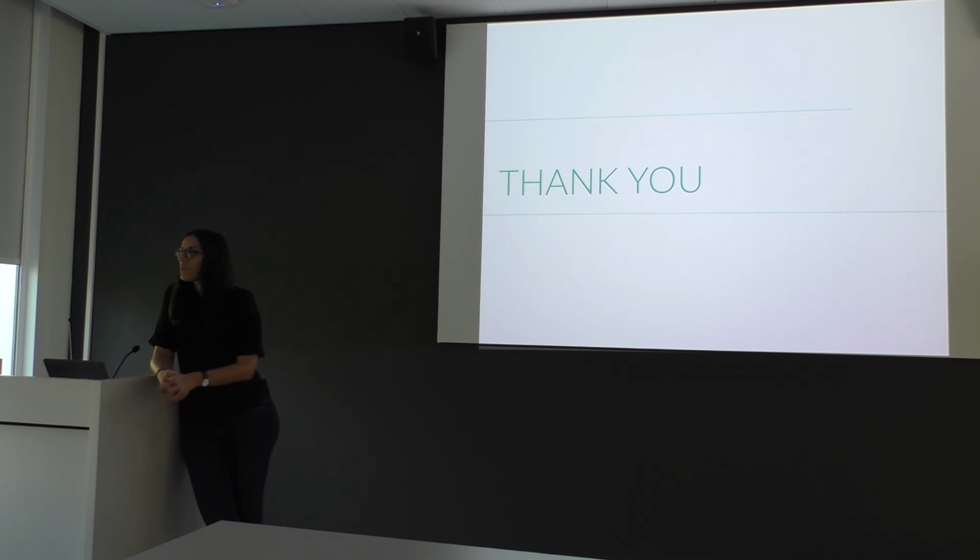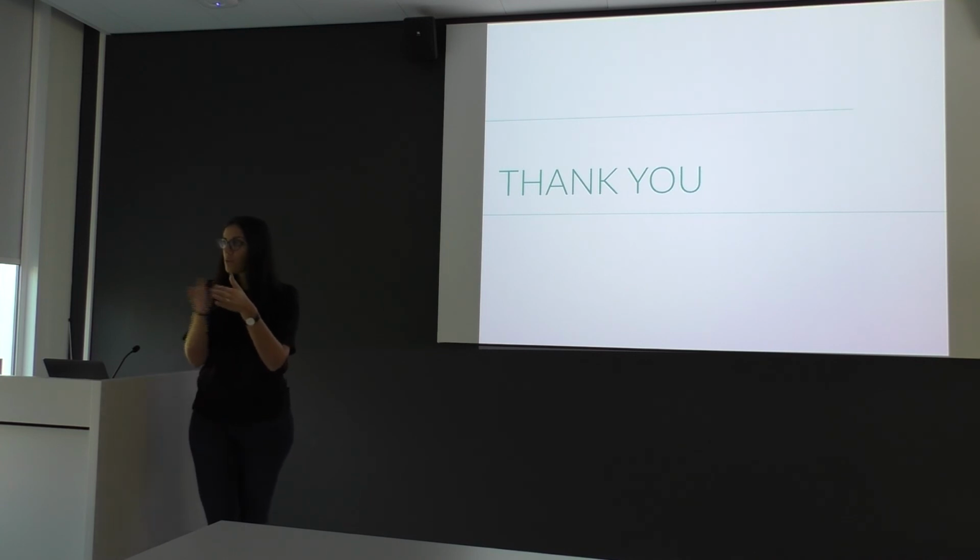And with the settings, it's the same as with any other microscope. You can of course, if you want, lower and use other settings, but then you still have to know exactly which one. It takes perhaps some time to find the right parallel illumination. These are all things you have to do yourself. But if your FEI engineer comes, it's fine. We normally have our registers, which bring you very close to what we had before. Whatever you do, it's very stable. You go back to the last settings which were saved, and you just do the high-end alignments, and it's actually fine.